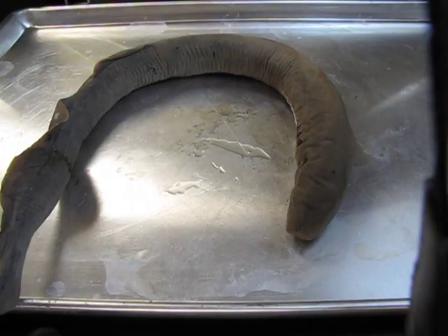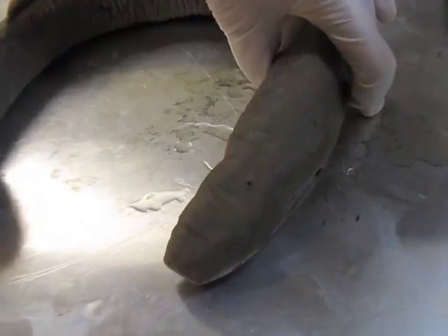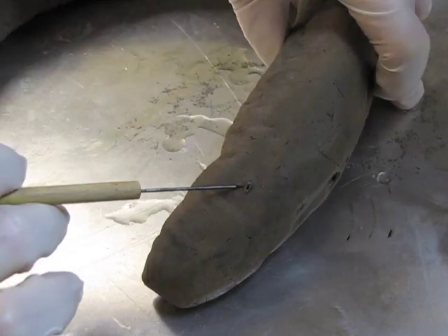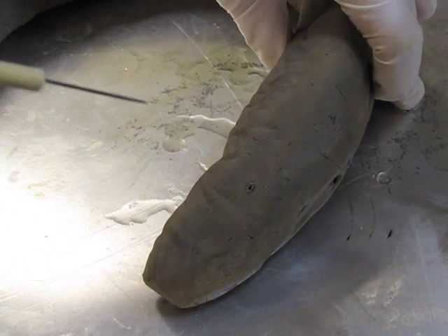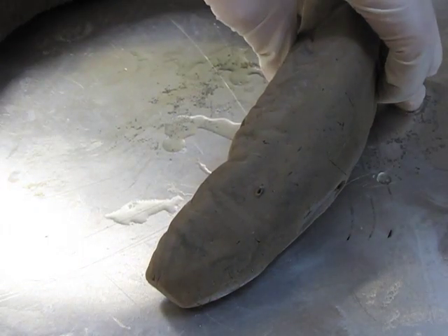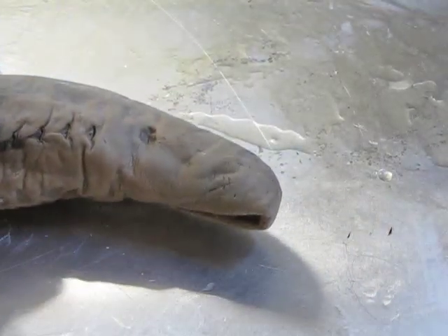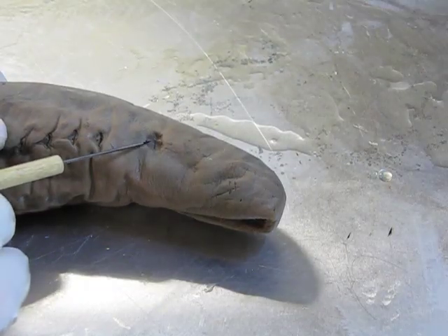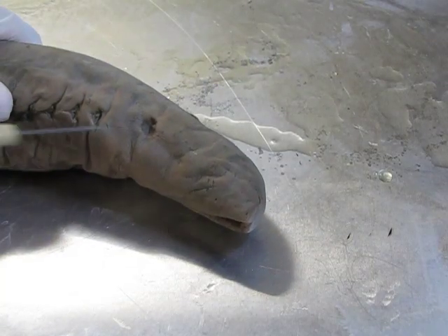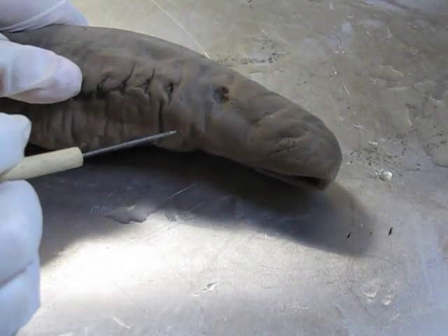Zooming in a little bit, there's an external nostril located at the top of the head — this little opening right here — and that opens into an olfactory sack inside, which is used for smelling. There's also a pair of eyes, one on either side of the head. There would have been an eye right here and one on the other side. There are no lids on these eyes, but they are fairly large for the size of the animal.